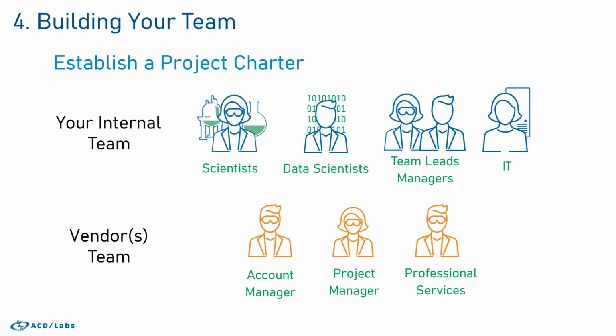And then building out your team. You have your internal team, scientists, data scientists, team leads, IT members, but always keep in mind the data consumers. The voice of the consumer is going to be key, and that's going to be a driving force in terms of how the system is going to be designed, because they are the ones who are providing the requirements for the data interactivity. And obviously, you have your vendor team, account managers, project managers, and professional services that will configure and deploy a solution when it's ready.